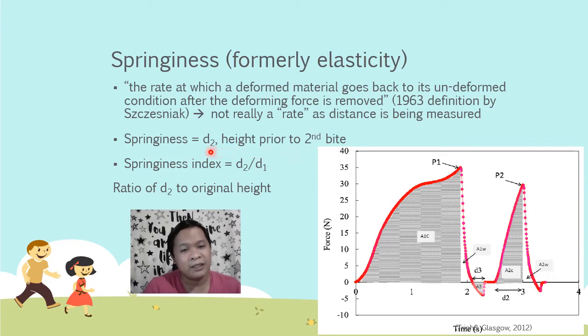Kasi parang mag-move lang siya to that point hanggang sa yung force ay mag-zero out, meaning hindi na tinutulak ng sample yung probe pataas. Okay?